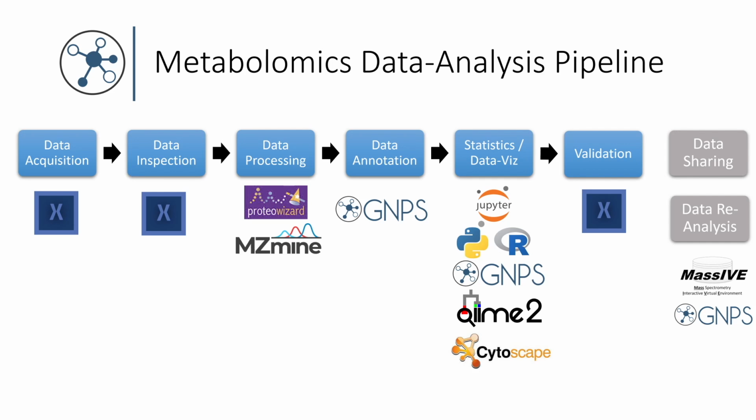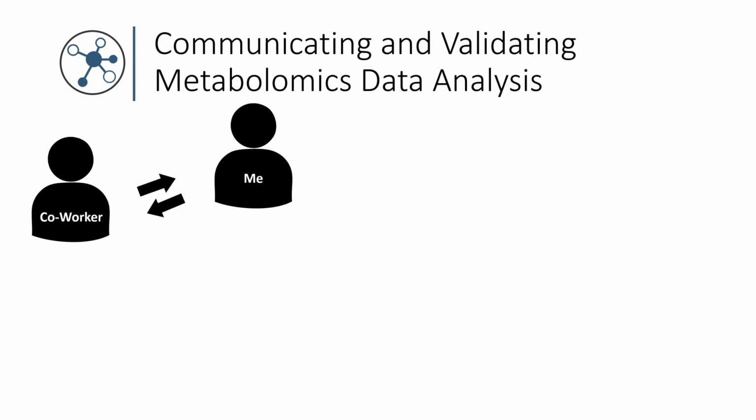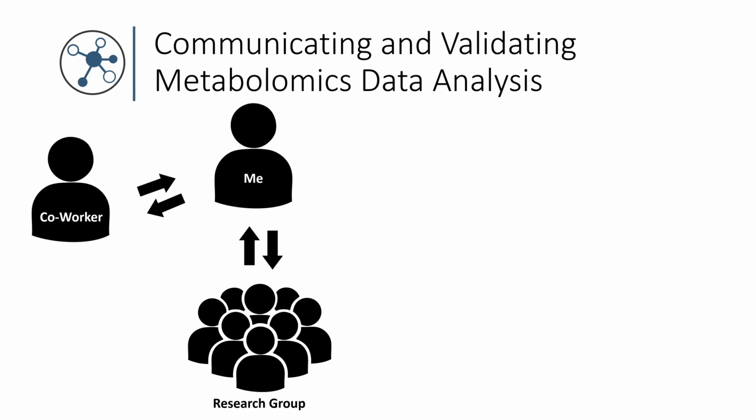While this pipeline works pretty well for myself, when we think about how we communicate this pipeline and how we interact with other researchers, that thing which seems very natural by now to me might not be that intuitive anymore. For example, working with a student, I have to make sure that they understand the same software, that they have this installed, that they know the right parameters, and it can sometimes be challenging. Now as a PI, even with a bigger group of people, it becomes even more challenging, especially when people have different preferences for different tools, or even different file formats from different vendors.